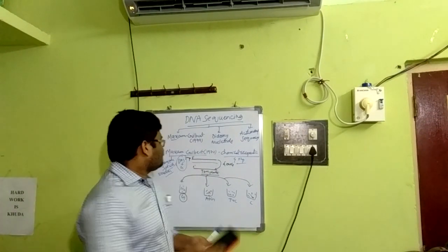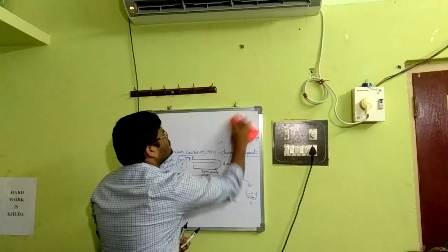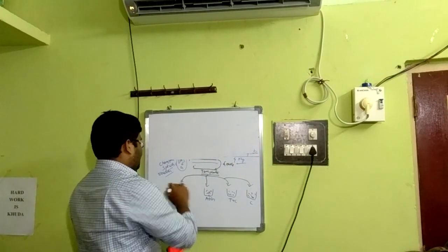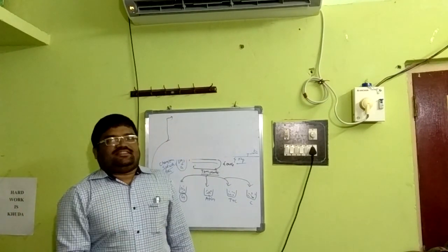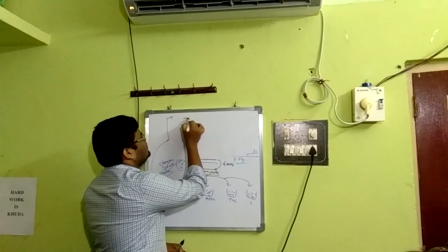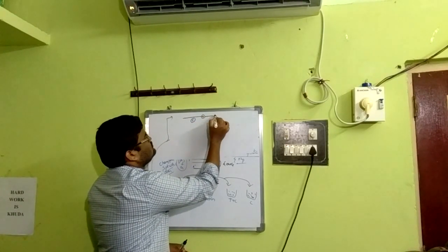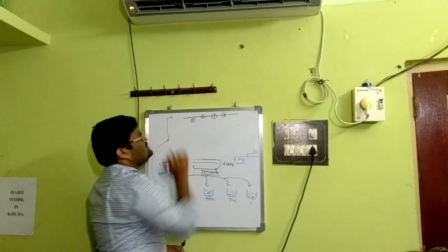Then what happens next? When it breaks down, it leads to the formation of different length DNA fragments. How? For example, consider a DNA fragment with respect to C, that means cytosine residues, at the 4th, 7th, and 10th positions there are C residues.